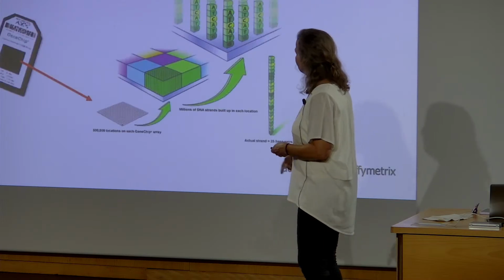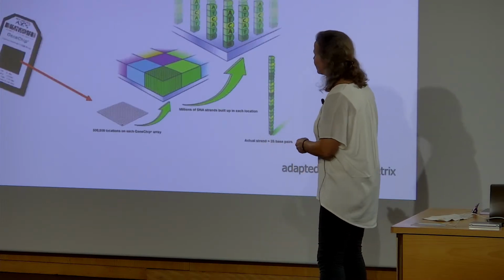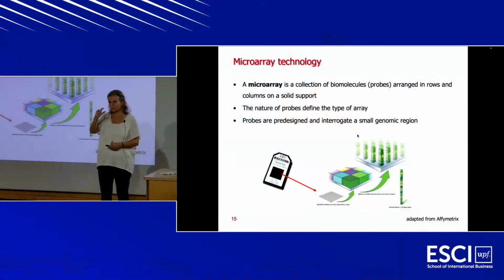Okay, so here we have artificial probes that interrogate a specific place in a genome, like gene ABC, just a specific area of gene ABC. When we prepare the sample of the breast cancer, we have a preparation of the transcript, we have fragmentation, we have done the amplification, and we have loads of amounts of transcripts there.